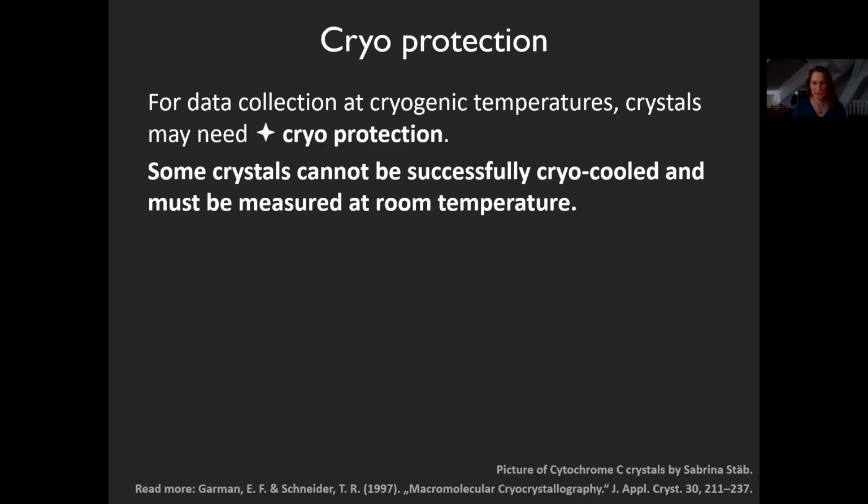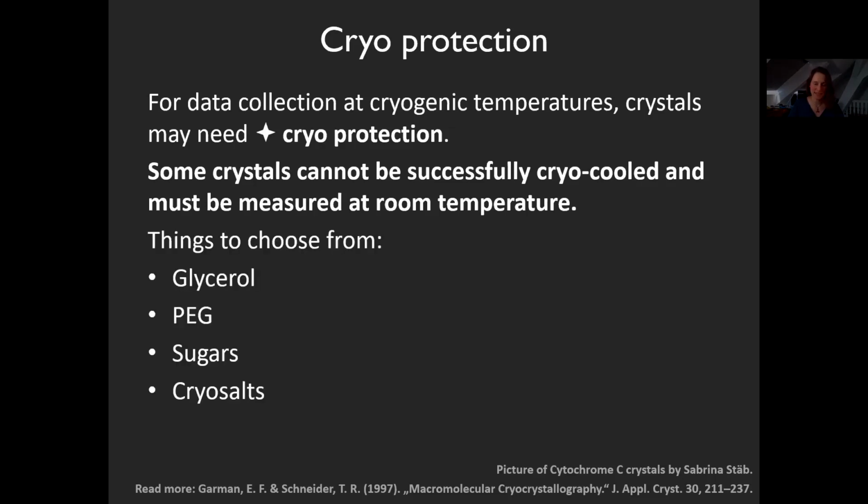If your crystal doesn't diffract, one of the first questions I always ask is, did you try if it diffracted at room temperature? Because both cryoprotection as well as cooling the crystal can lead to deterioration. And it is good to establish that the crystal diffracted at least at one point in time. There are different things to choose from. Glycerol is very popular, so are PEGs, which are often already in the mother liquor, so they're there.